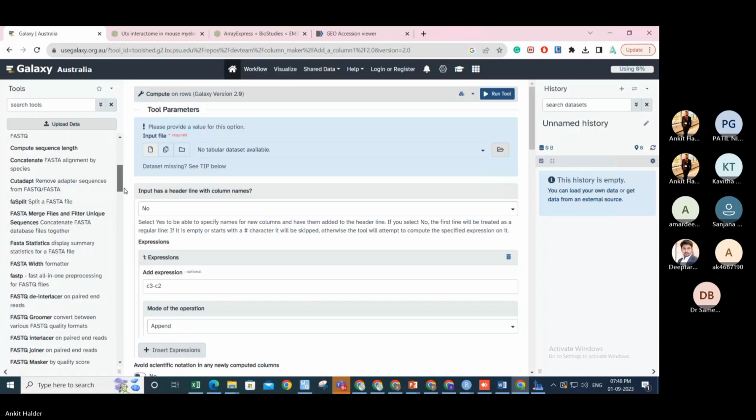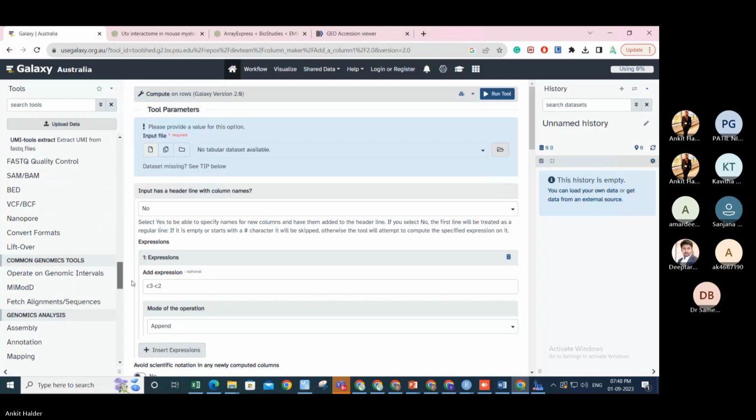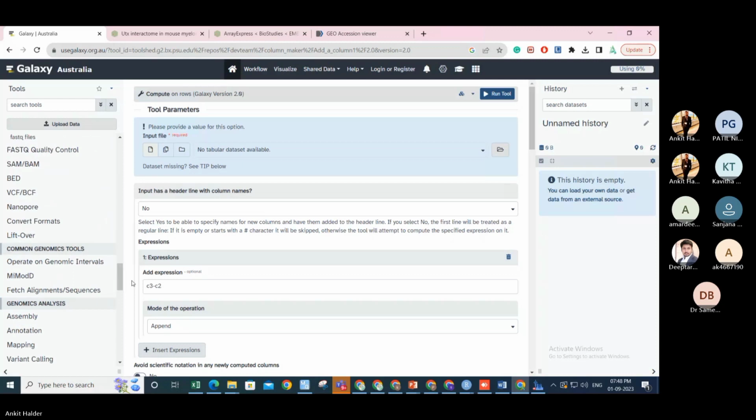So this is running all these tools which you can easily install and perform and analyze, but if you are not comfortable you can also use a different server. All these tools also require certain computational skills, and because the data sizes are huge, they require quite a bit of processors and setups that would support this kind of data.